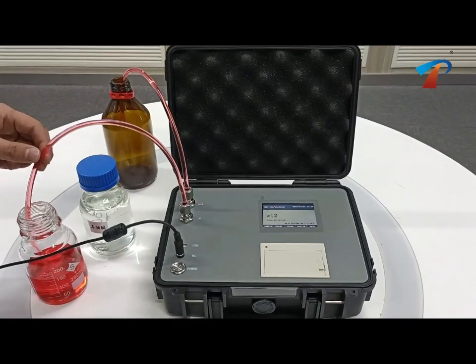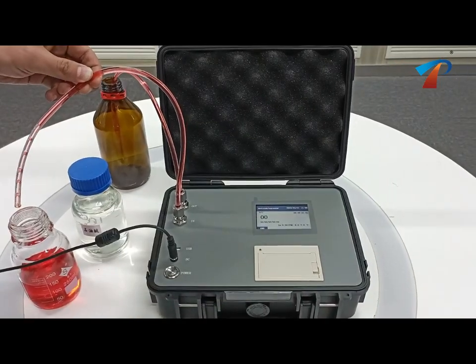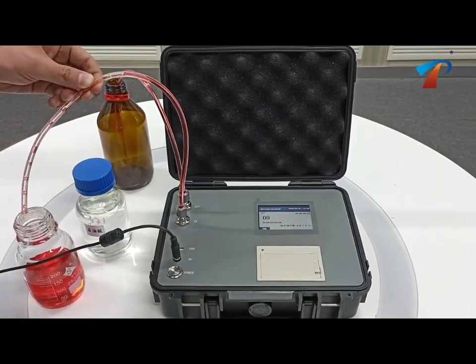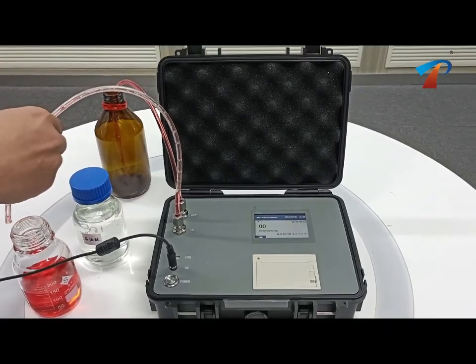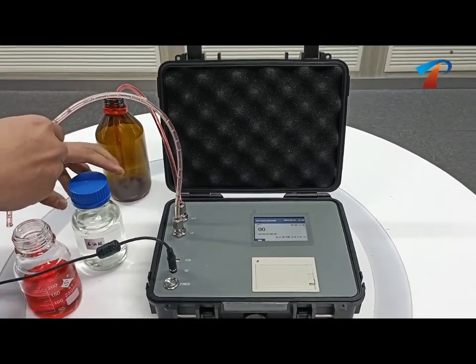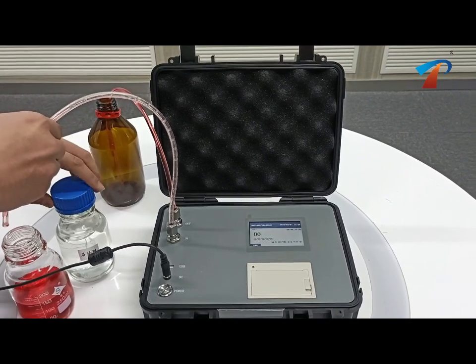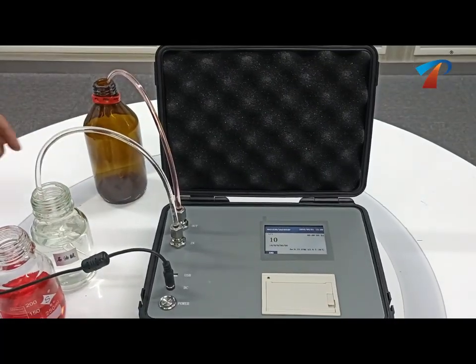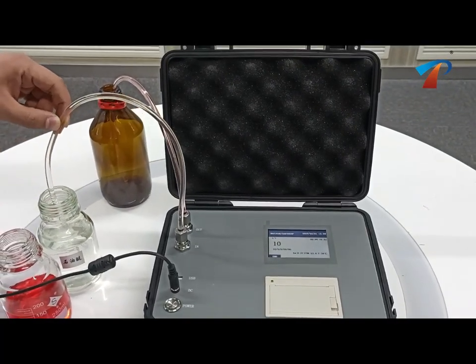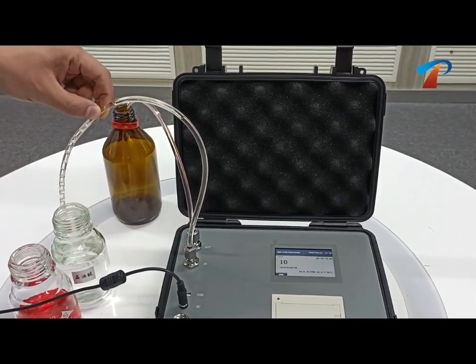After the test, it is necessary to clean with petroleum ether. Start with a single machine and put the liquid inlet pipe into petroleum ether for cleaning after there is no oil sample in the liquid inlet pipe. When clean petroleum ether appears at the liquid outlet, put the liquid inlet pipe into the air for emptying.